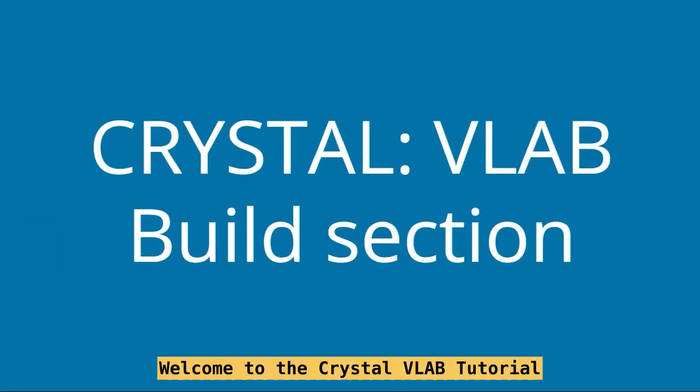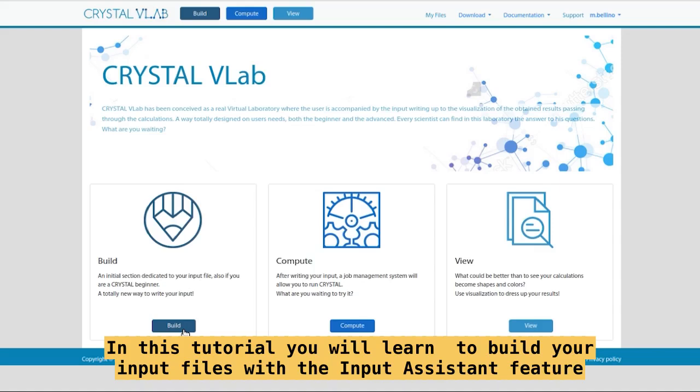Welcome to the Crystal VLAB tutorial. In this tutorial you will learn to build your input files with the Input Assistant feature.